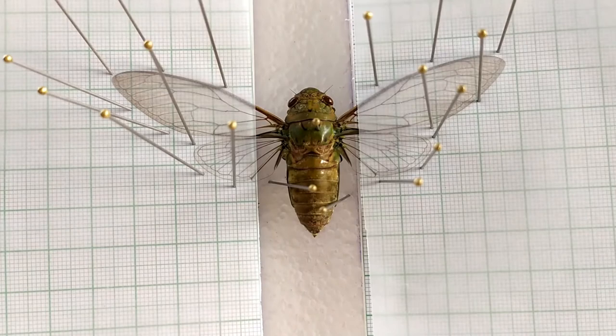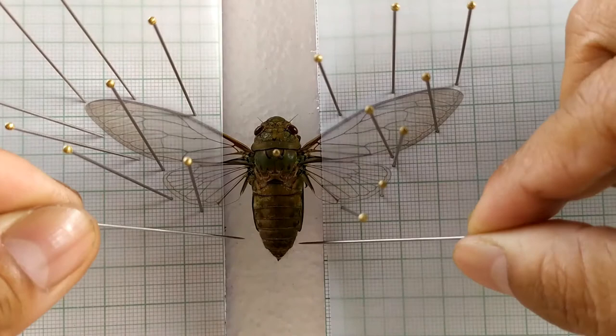Now carefully remove the two pins that were used to secure the body of the specimen, and reinsert them below the abdomen such that they form a cross onto which the abdomen is located.